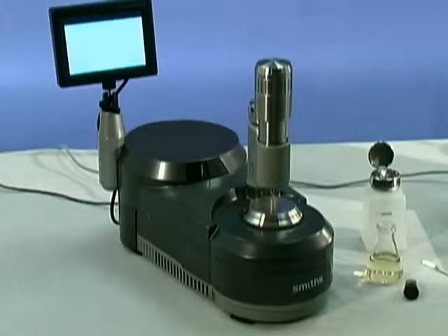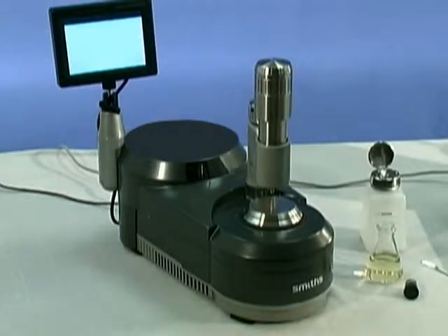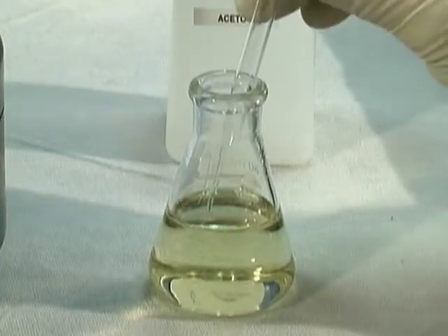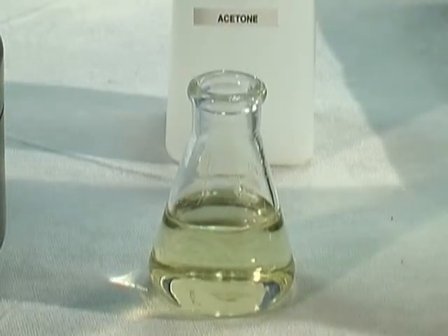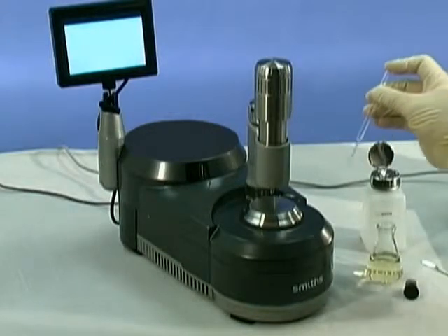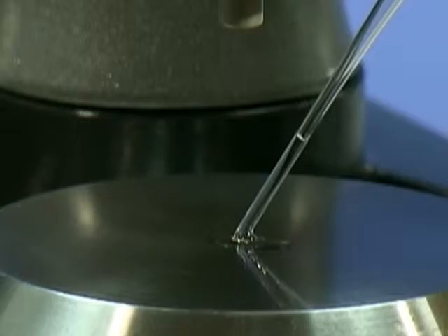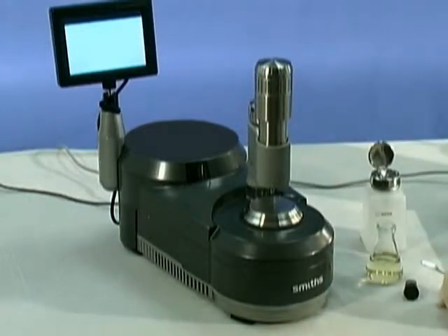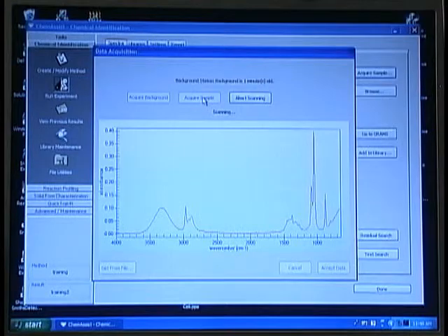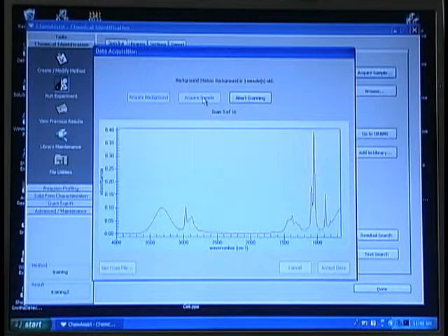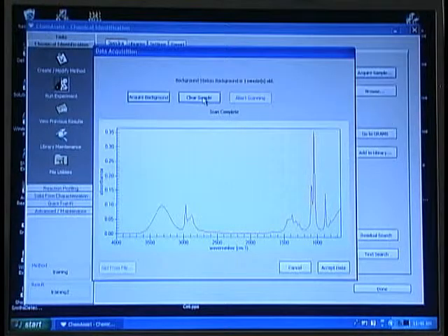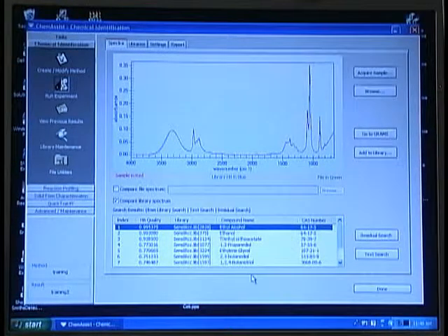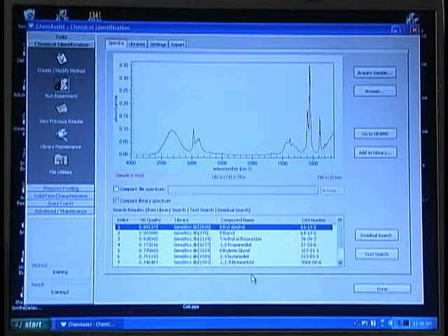The simplest way to do this for most samples is to use a Pasteur pipette, put it into the sample, and allow capillary action to pull the sample up into the pipette. To dispense the sample onto the diamond, sometimes all you need to do is touch the tip of the pipette to the diamond. When the sample is in place and you see a spectrum on the display, you click Acquire Sample. The system will scan for the designated number of scans; when it is complete, click on Accept Data, and the software will perform a spectrum match looking for the best fit with your sample spectrum.